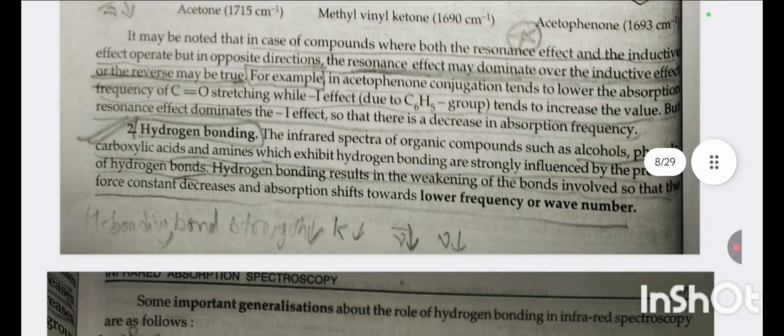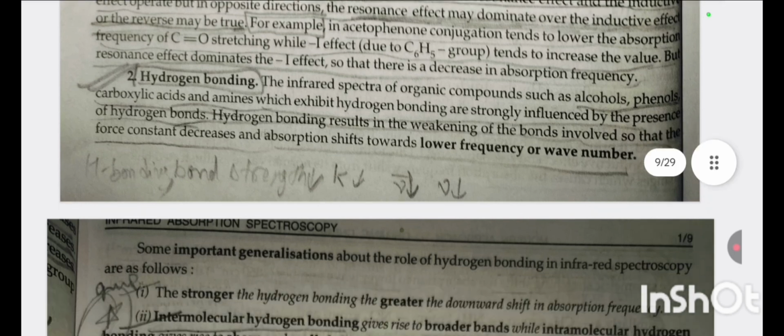Second, hydrogen bonding. The infrared spectra of organic compounds such as alcohols, phenols, carboxylic acids, and amines, which exhibit hydrogen bonding, are strongly influenced by the presence of hydrogen bonds. Hydrogen bonds result in the weakening of the bonds involved, so that the force constant decreases and absorption shifts towards lower frequency or wave number.